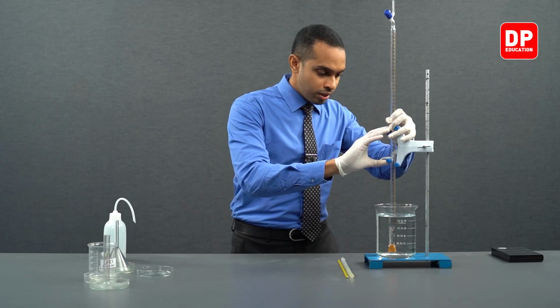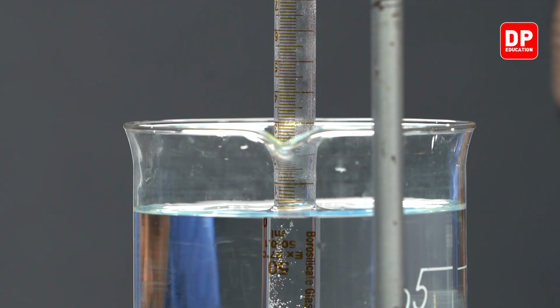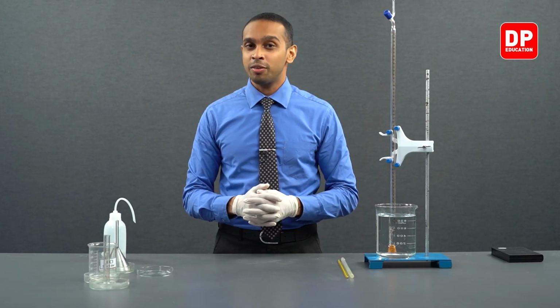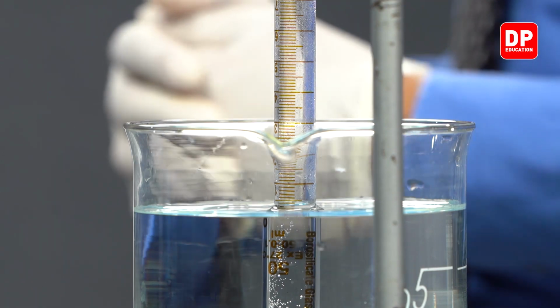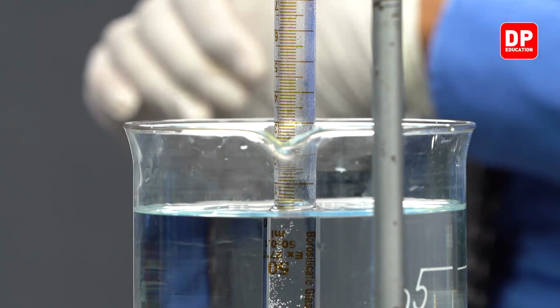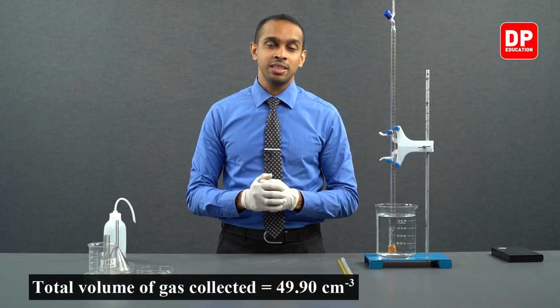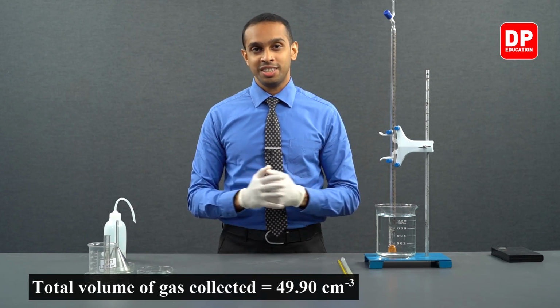We have to bring it a little bit further down. Now we can see that the two water levels inside and outside the burette are aligning with one another, and the reading at that point was 0.1 cubic centimeters, indicating we have collected 49.9 cubic centimeters or 49.9 milliliters of hydrogen gas.